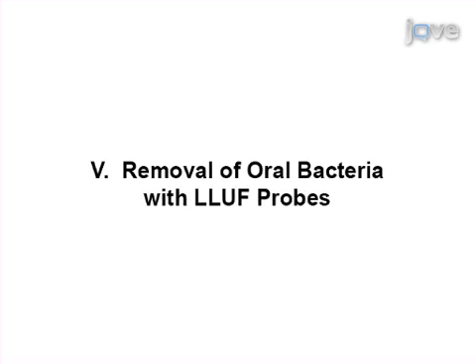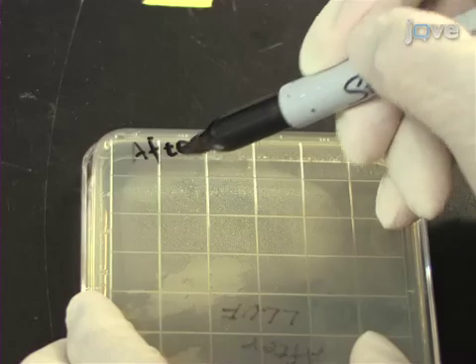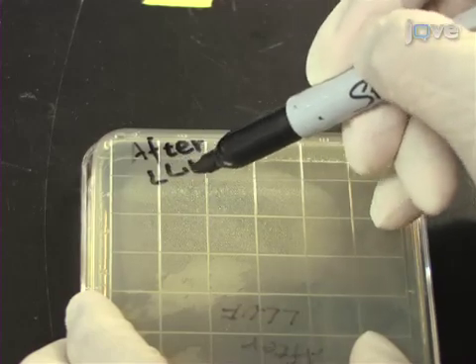This section determines the capability of LLUF probes to remove the oral bacteria. For bacterial detection, culture the saliva samples before and after LLUF probe collection on agar plates.